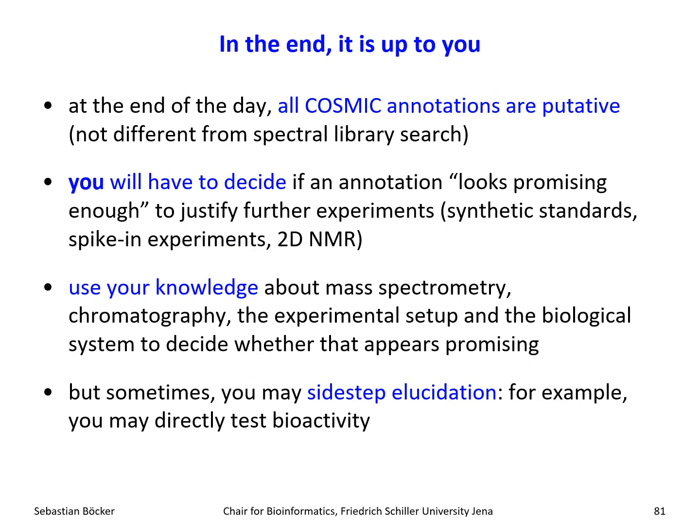But in the end, Cosmic, CSI FingerID are means to help you, and you have to understand that obviously all those annotations are putative. And in the end, you have to decide whether it's worth to do extra experiment. You can use all your experience there. You can make additional experiments. You can say, no, this is not going to happen in this organism. This is all stuff that we don't use for a good reason. And I'll definitely make a separate talk about that at some stage.